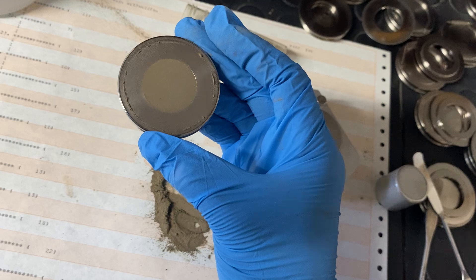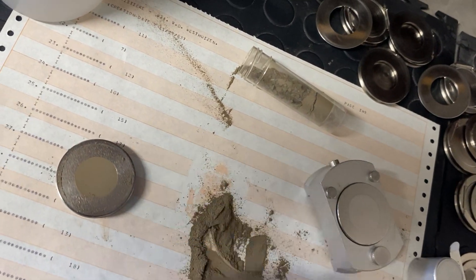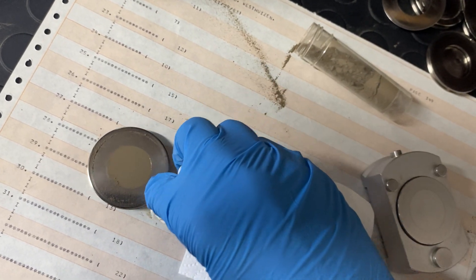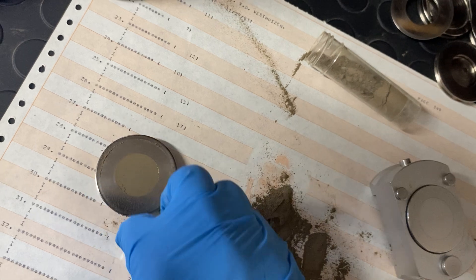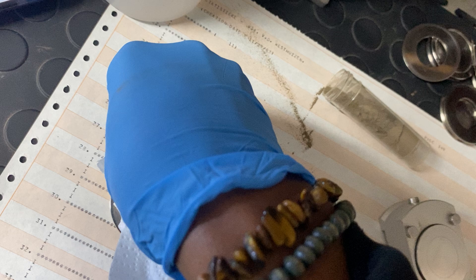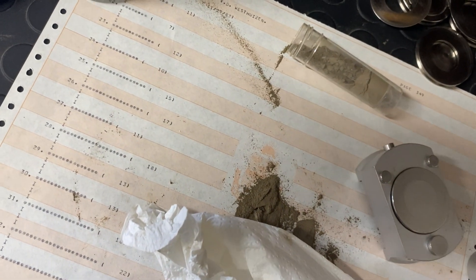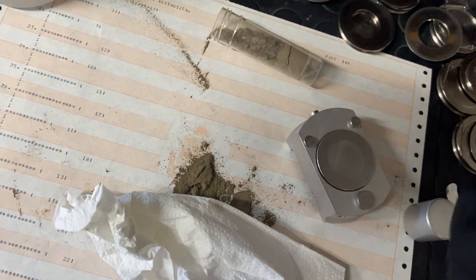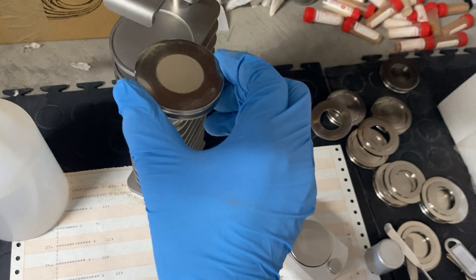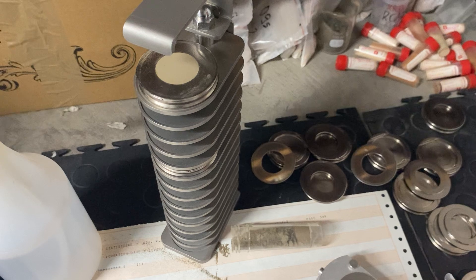The sample is now ready for XRD analysis. You can clean any remaining powder from the edges a bit more, and then store the finished sample inside the multi-sample holder. There you have it — it's ready for XRD analysis.